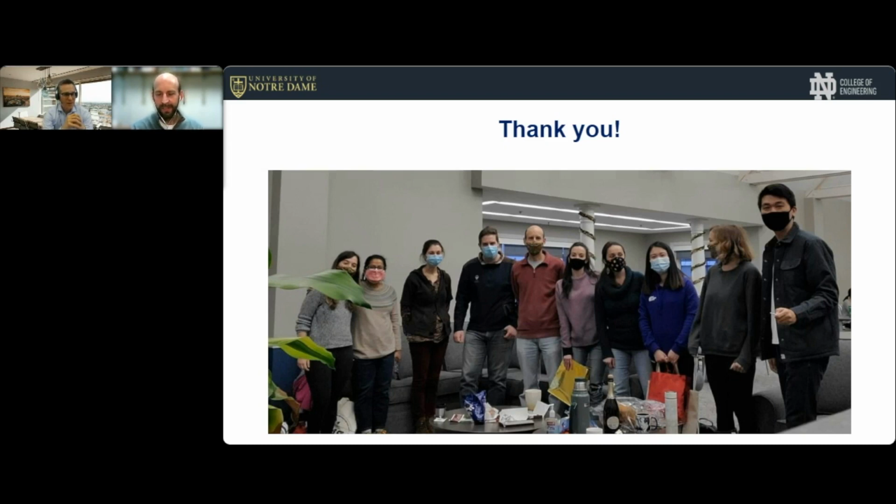Okay, the next question is actually coming from your former co-worker Marcelo Aibar from Universidad San Sebastián. Great presentation, Robert. Do you think there is a way to couple the OCT with another technology to somehow identify bacterial species in OCT images? For example, something that generates a change in specific bacteria density?